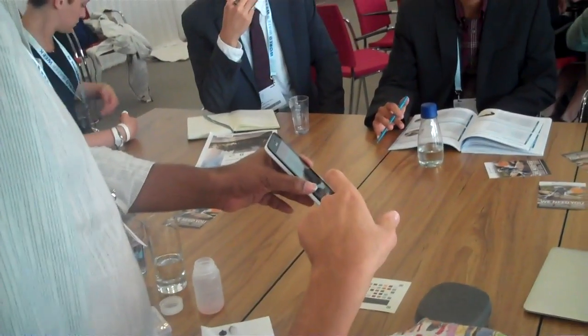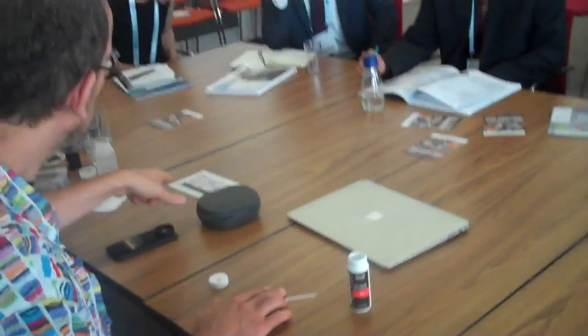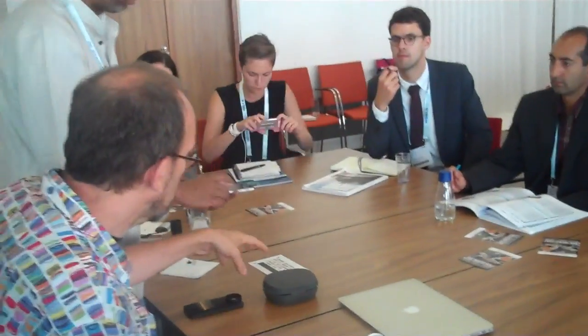The application we have, called Caddisfly, does this test the same way. When we start the test, the first thing Sam will do here is detect this card, find it, and set the color balance right, so the lighting conditions are right.